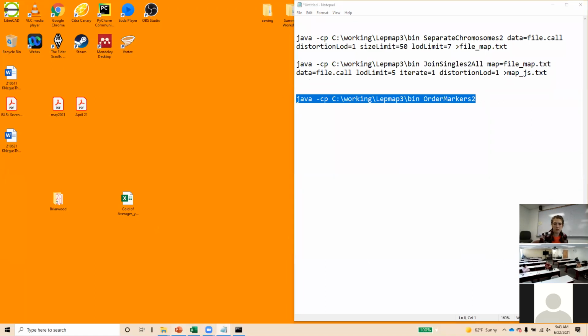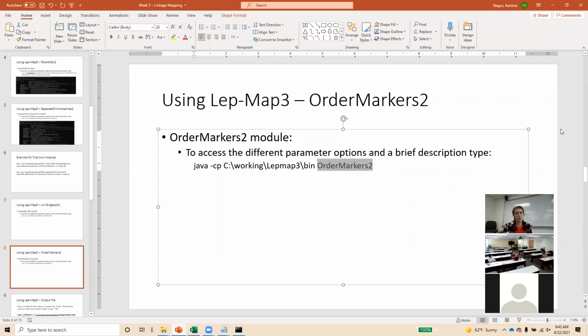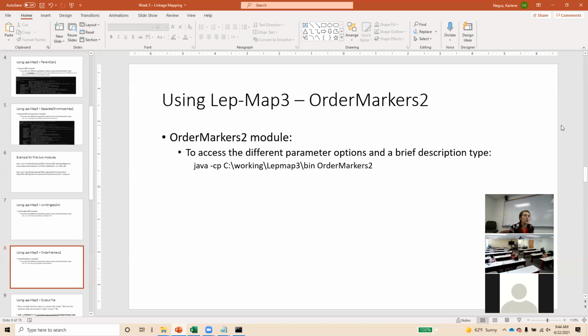I'm just wondering how many programs you need to download onto your laptop to run all this? Basically, you can do almost everything, if you have all the files already, with Excel, Tassel, Lep-MAP3, and I've been using R/qtl for QTL mapping. But if you keep your map small enough, you can do it in MapQTL6. A lot of work. Yeah.